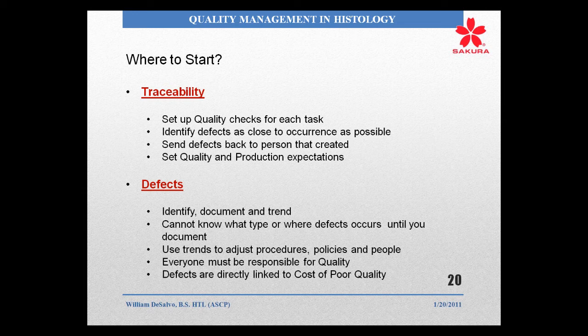And then set quality and production expectations. If you're working within that quality management system, you have to have quality and production expectations for every measurable and critical task that you have in the laboratory.